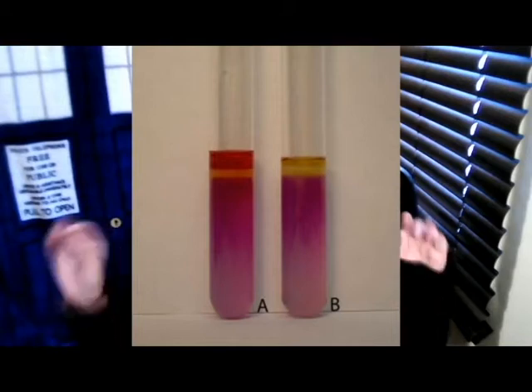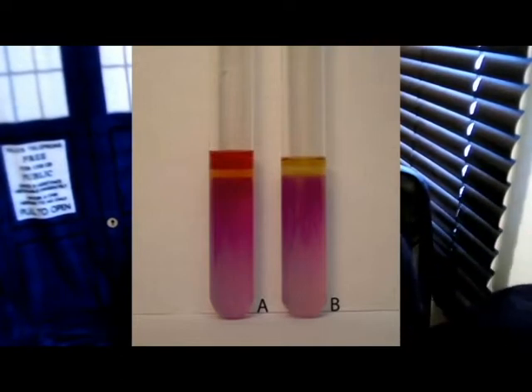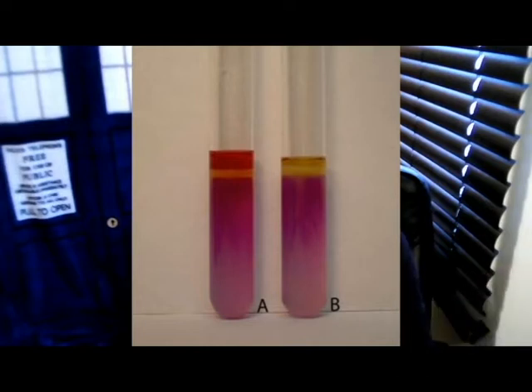Now remember, you can't just put random letters on the test and get partial marks for it. So you need to understand that the MIO is a motility test. You need to understand that MR and VP are 2 different tests. You can't just put MRVP MIO because I have seen that before. So if we go back to the MIO test, your indole is the red and yellow layers. So is it positive or negative for indole? After you add the Kovacs reagent, it tells you whether or not it's positive for indole.